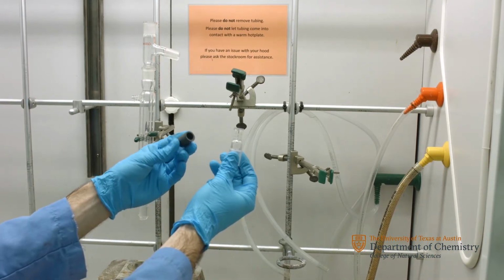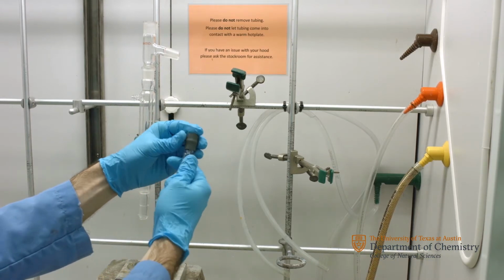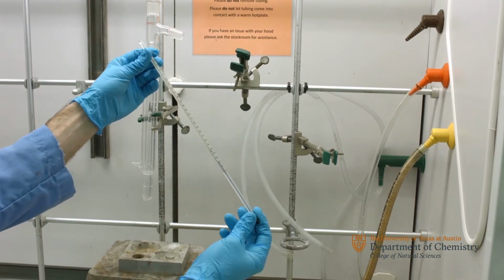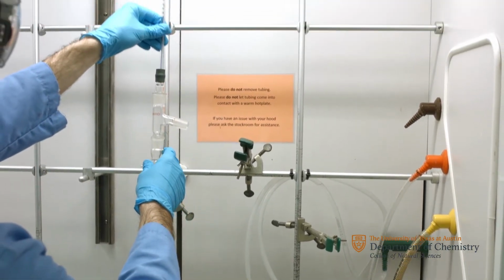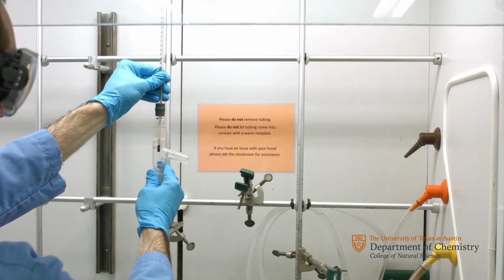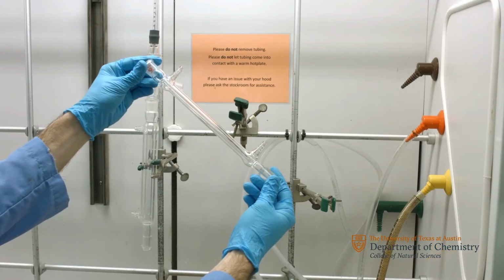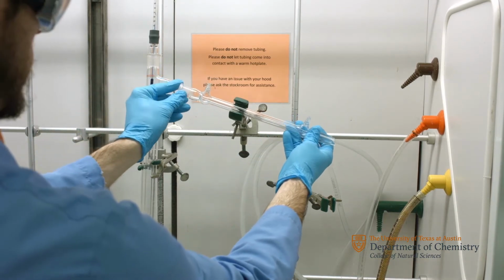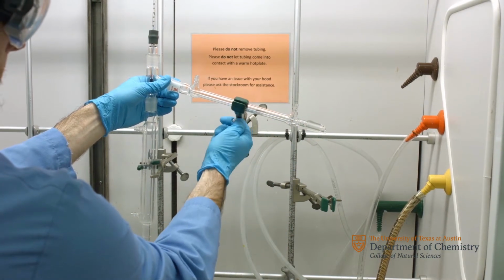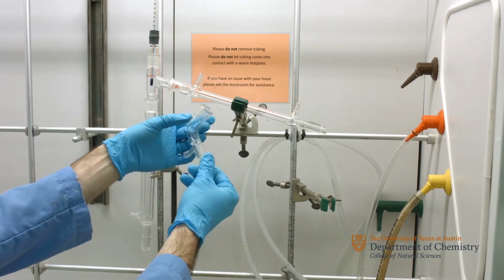Next, attach the rubber thermometer adapter to the glass thermometer adapter, and then connect it to the distillation head. Now insert the thermometer to the appropriate position. Now, attach the condenser to the distillation head with the glass outlets facing up. Connect the vacuum adapter and then attach the keck clamps to the appropriate glass joints.